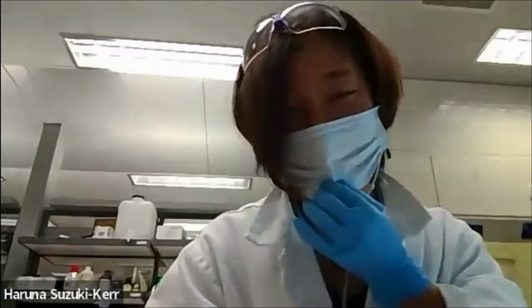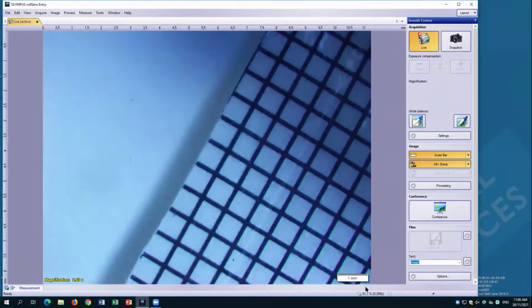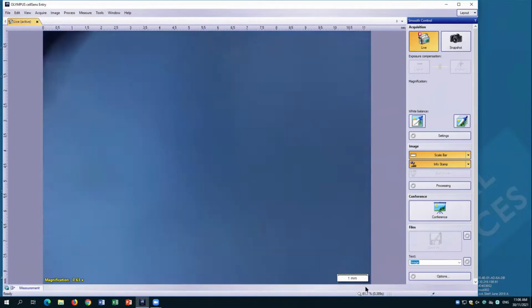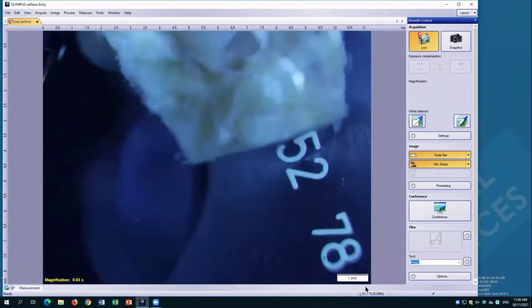And hopefully, you can tell me more. I've got a dissection microscope, and that's connected to this Zoom on this computer now, so it's just a live view here. So I'm going to stick the cochlea underneath, and hopefully I can turn it around for you.